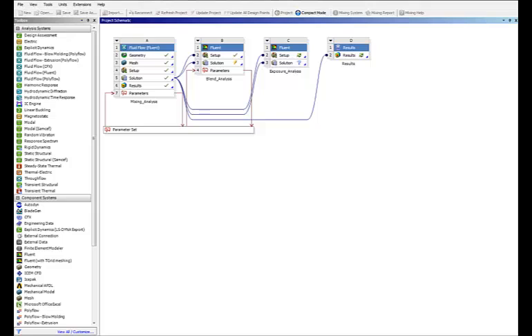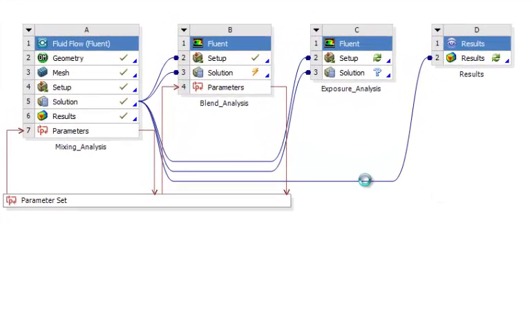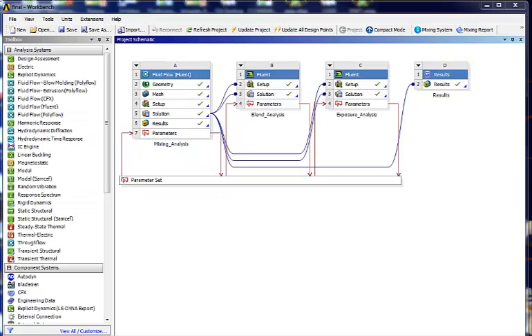Very quick and easy to create the geometry. Now to run the simulation, nothing to set up. Simply click update simulation. Now at this time, the mixing analysis is complete. The blend time analysis is being performed. And after that, the exposure time analysis will be performed.